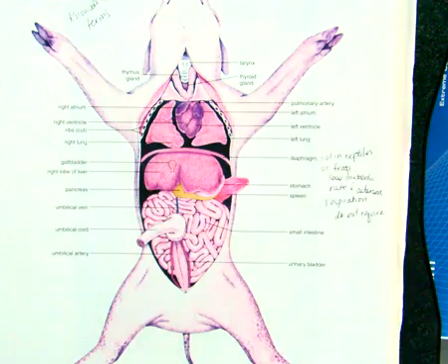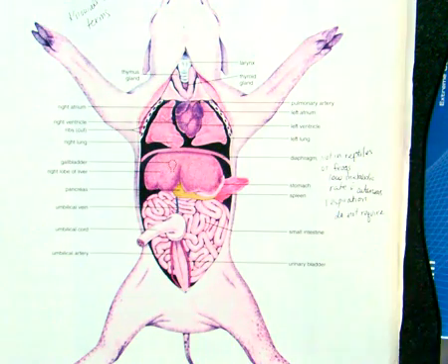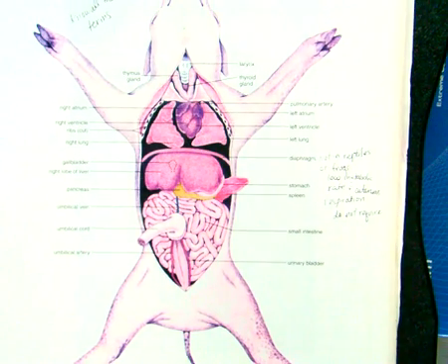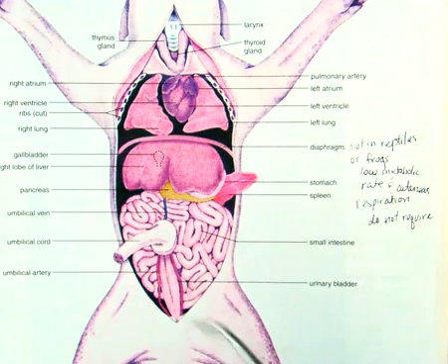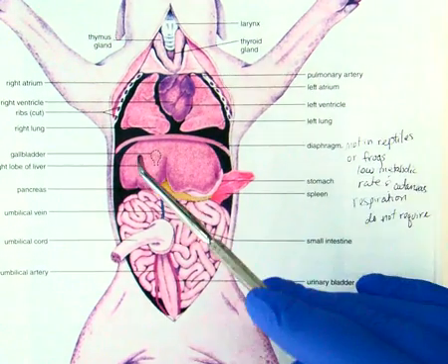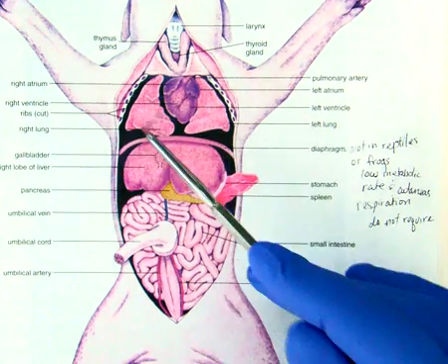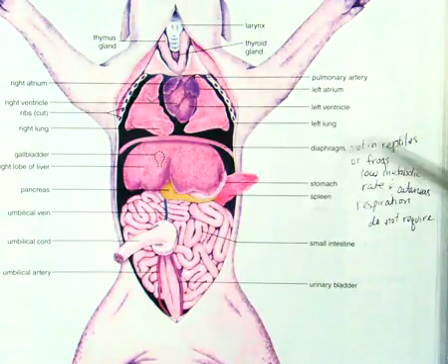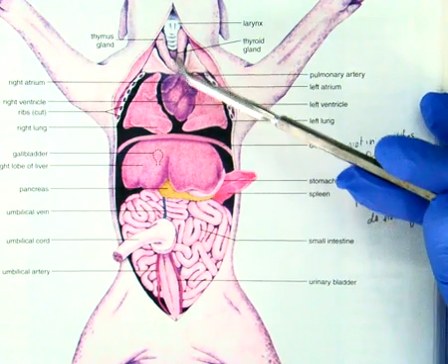I don't think light is going to help this, it's just going to bleach it out. So I had to zoom out so you get the big picture, and then we'll zoom in to take a look at this. The thoracic diaphragm separates this. This is a skeletal muscle that separates the thoracic cavity from the abdominopelvic cavity in mammals. You should be able to see most of these features. They're pretty straightforward. Again, for context, there's a larynx up here and the trachea falling down here.